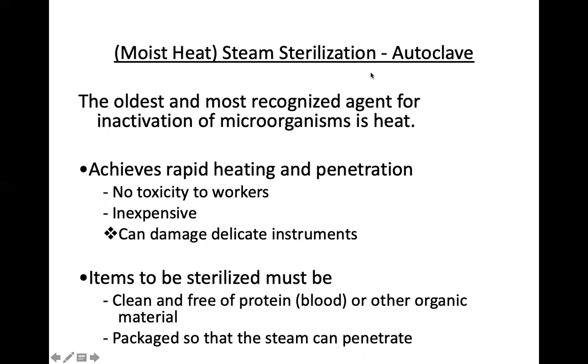It's a very useful gadget in the laboratory, next to theater, in surgical departments. The autoclave is a very, very useful machine. In that case, it's very, very big.